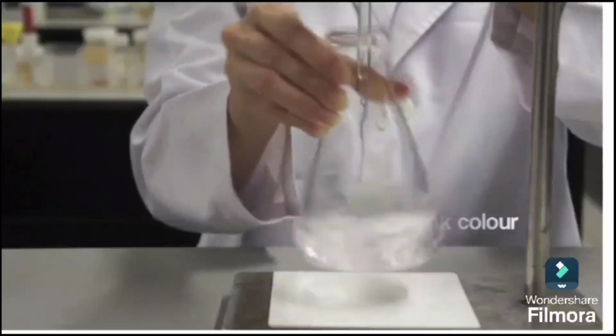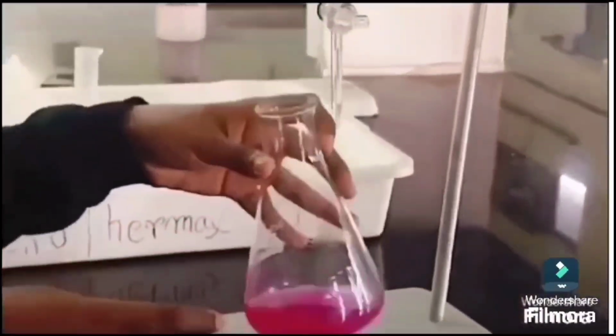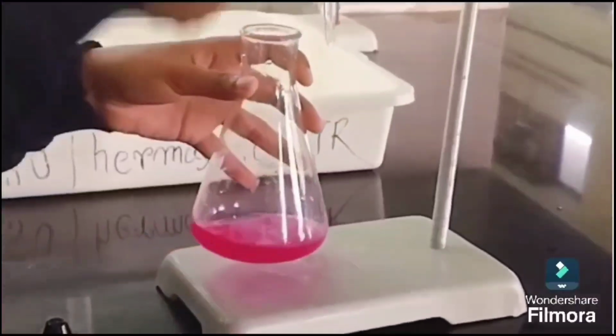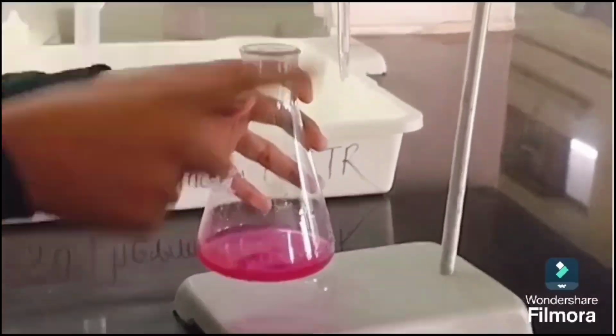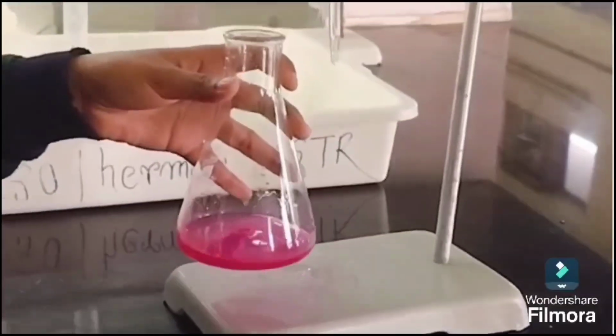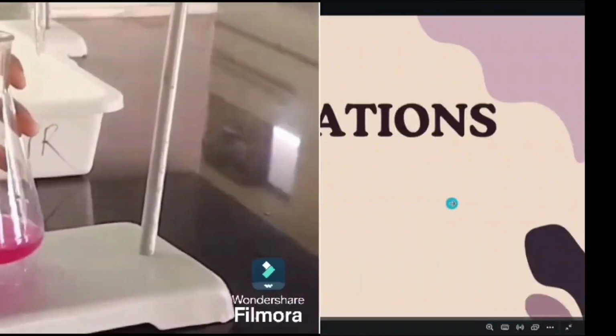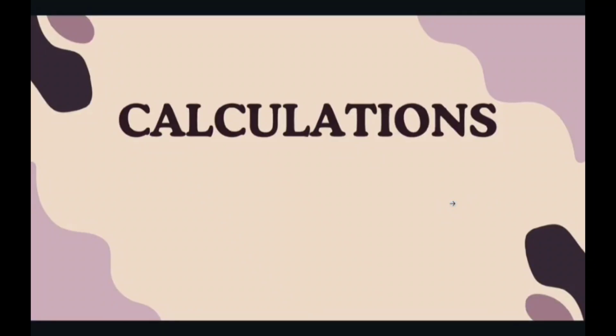Here is why the sample turns pink after titrating with the NaOH solution. In basic conditions, phenolphthalein molecules lose protons and form a pink colored anionic structure, which absorbs light differently and appears pink to the eye. Coming up next is the sample calculation.